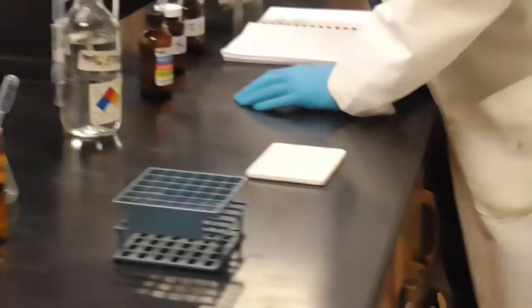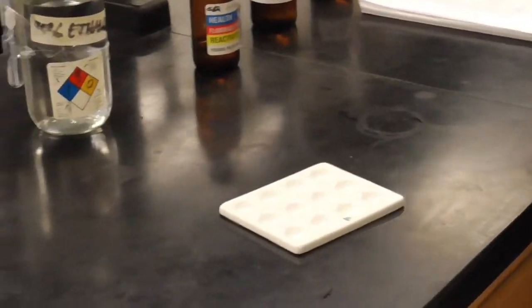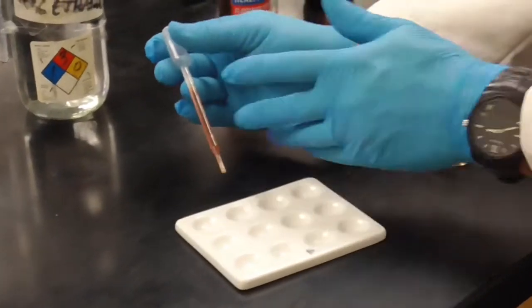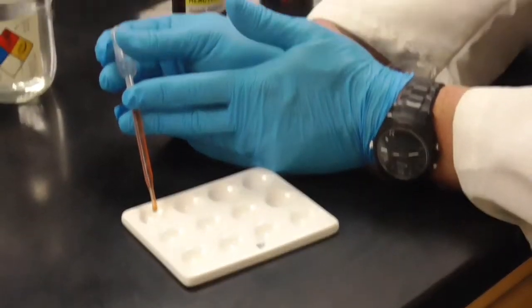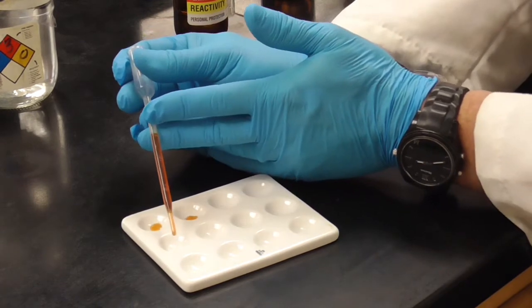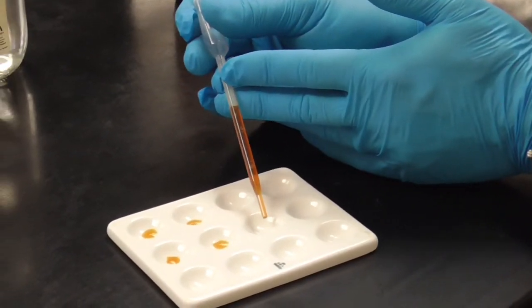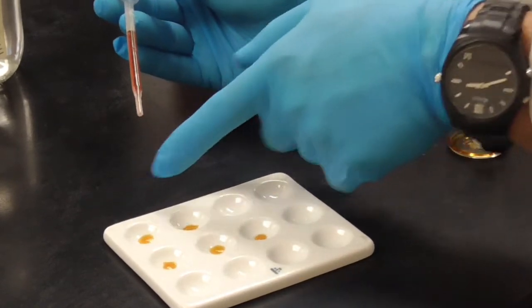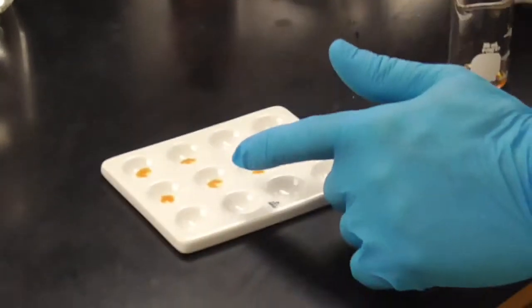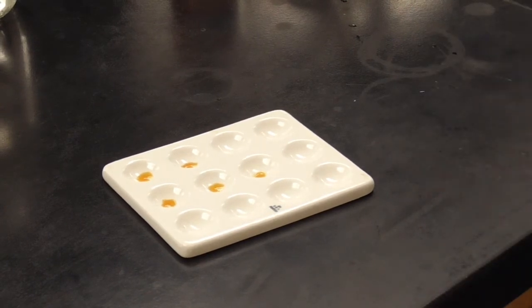And you've seen me do this several times. We have 5 test tubes, so we just need to get 5 spots ready. Alright, so I guess we'll do one here, one there, and then maybe 3 down here. So that'll be for our sodium chloride, our ethanol, and then the silver, and the mercury, and the lead. Okay, we'll see you back in 15 minutes.